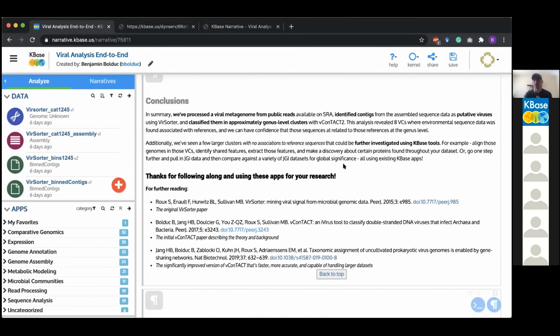And so for those of you who are microbial, now that you have a cluster or a grouping or an annotation associated with them, you can use the KBase family of apps to do other processes. Now that you have a group, you probably have shared genes or shared features. So you can take those and maybe do a phylogenetic analysis.